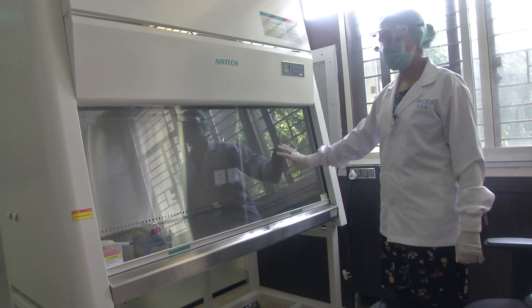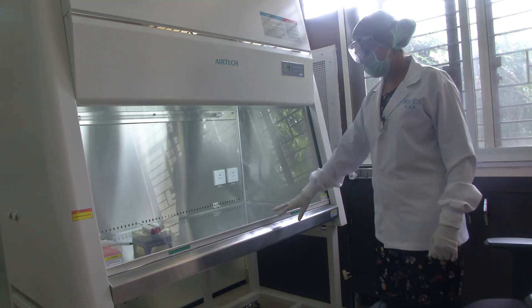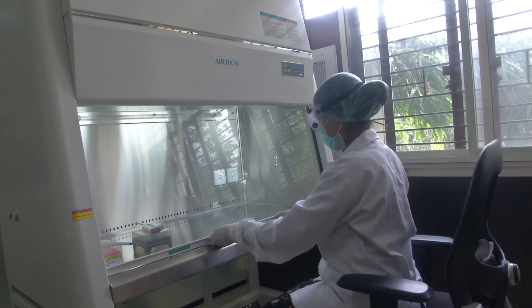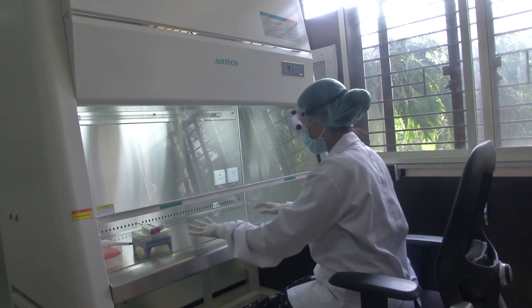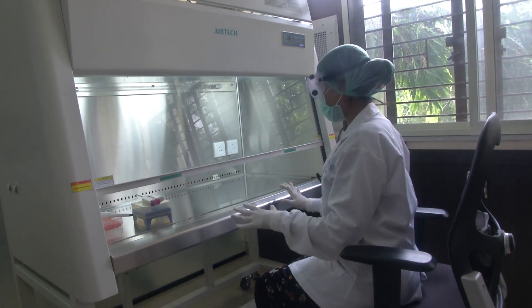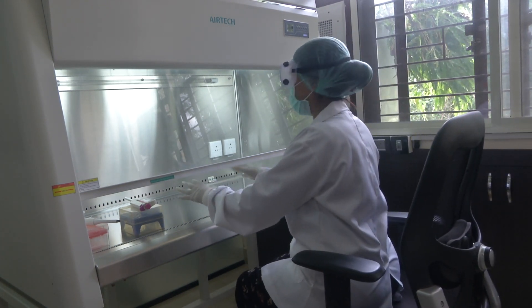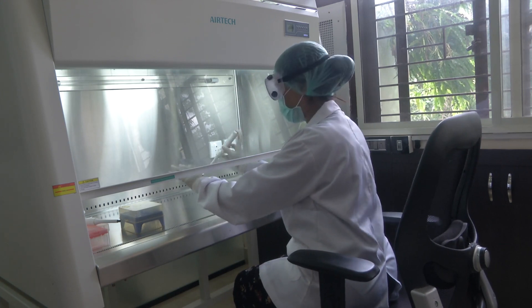Now, when I want to use my workstation, there is a white light source — my workstation is then illuminated with white light and I can use it. While I use it, I sit in a position such that the sliding sash is up to the safety line, and I have all my things ready to perform my experiments. This is mainly used for cell and tissue culture and biological samples, all of which could be a contamination hazard to the person working with them. Hence you have such a cabinet with a contained environment to use the pipette and perform your experiments within the containment.